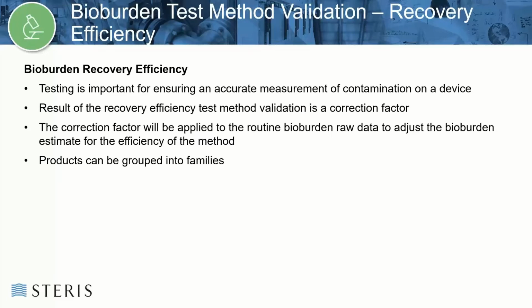For example, take the setting of the verification dose during the irradiation validation process. The measured bioburden contamination values ultimately determine an appropriate dose for the verification dose experiment to ensure the product will obtain a 10⁻⁶ sterility assurance level in the routine sterilization dose. Hence, the importance that data from the test method is accurate.